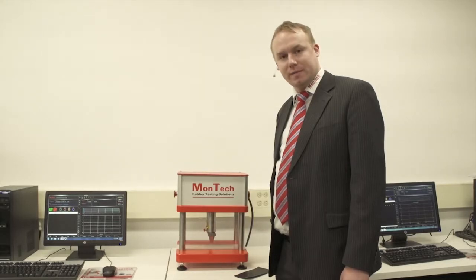Hello, my name is Ralph from Montec Rubber Testing Solutions. Today I'd like to introduce you to our sample cutters for cured rubber specimens.